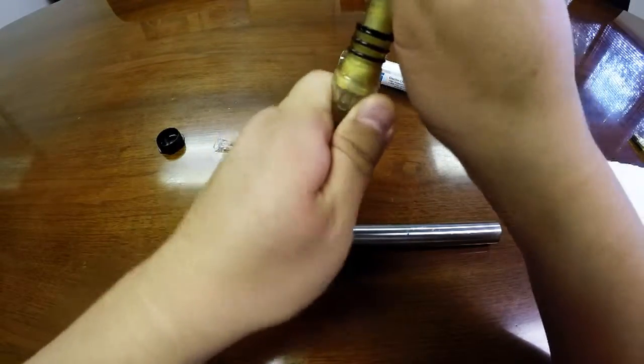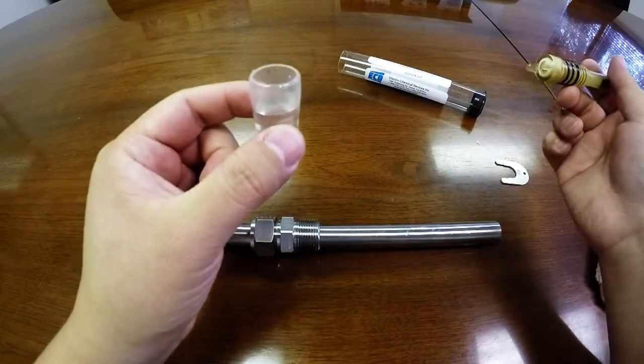Remove the solution boot and store the boot for a later time.